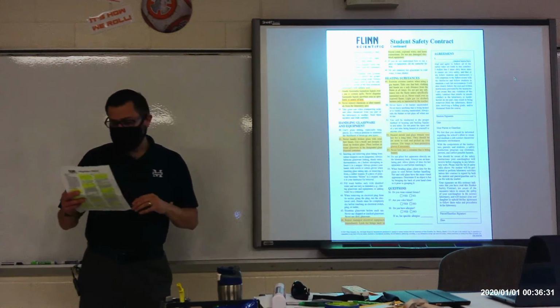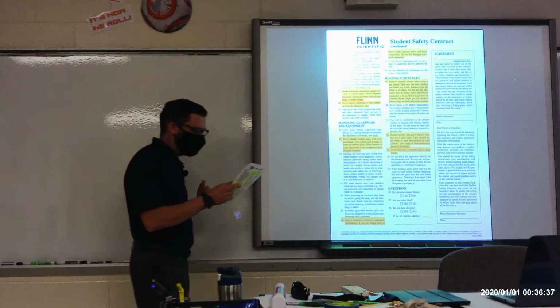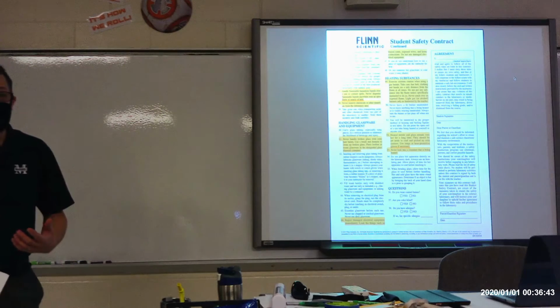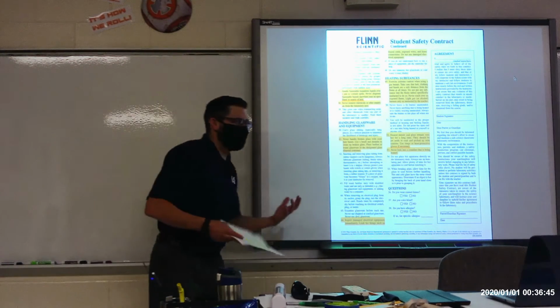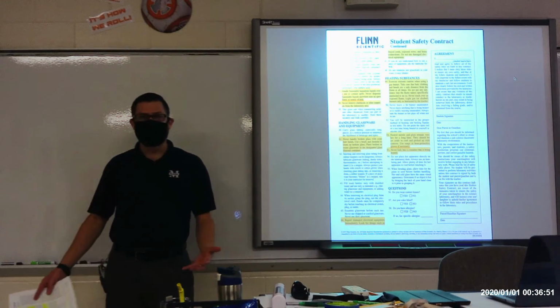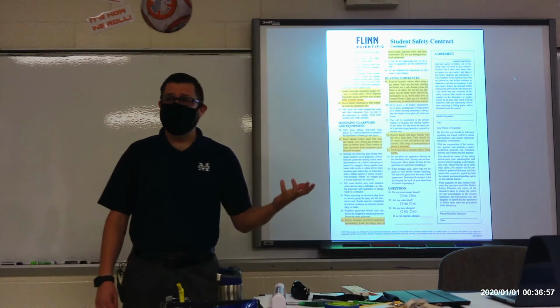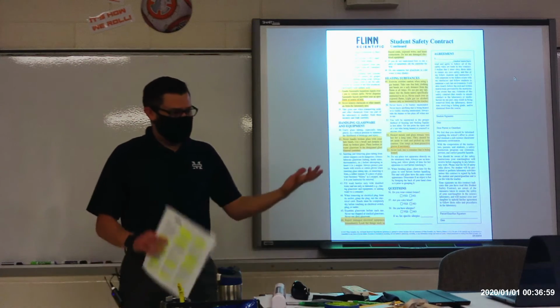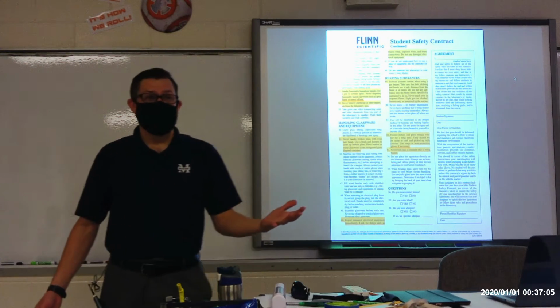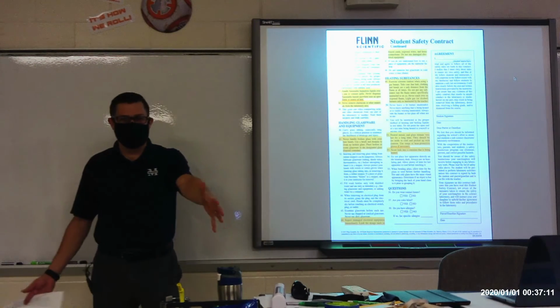All right. Next section on heating substances, number 49 and 50. Talking about basically taking care when you're around fire. Again, it always surprises me how many times students seem like they've never been in the kitchen before and never seen a hot stove or anything. One of the most common and most ridiculous things that I will see is someone will look at a hot plate and say, "Is this thing hot?" And they reach out and try to touch it. Like, well, if you're wondering if it's hot, why would you touch it? Because you're just going to burn yourself.